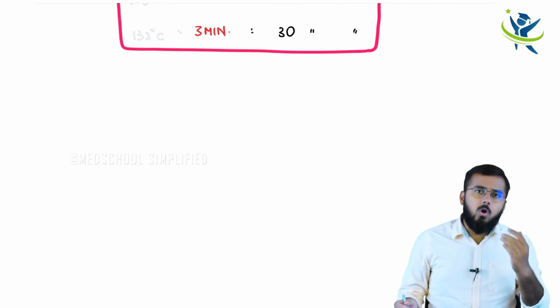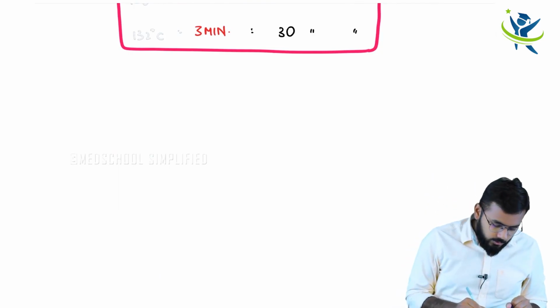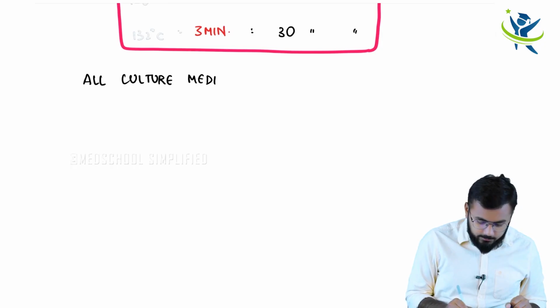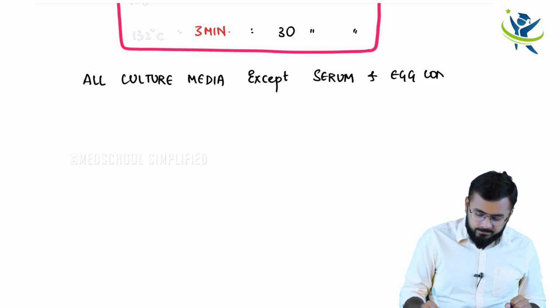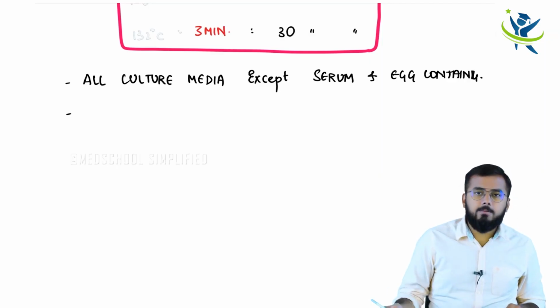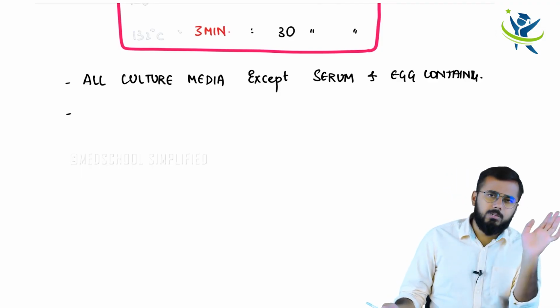So autoclave is used for all culture media except serum and egg containing culture media.